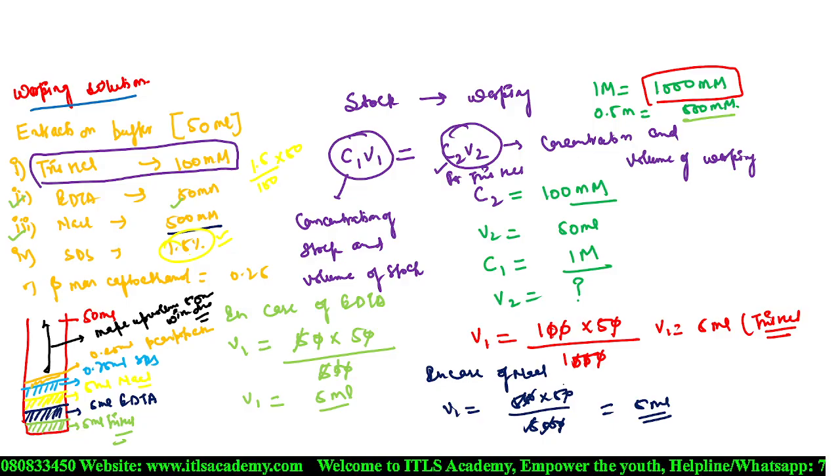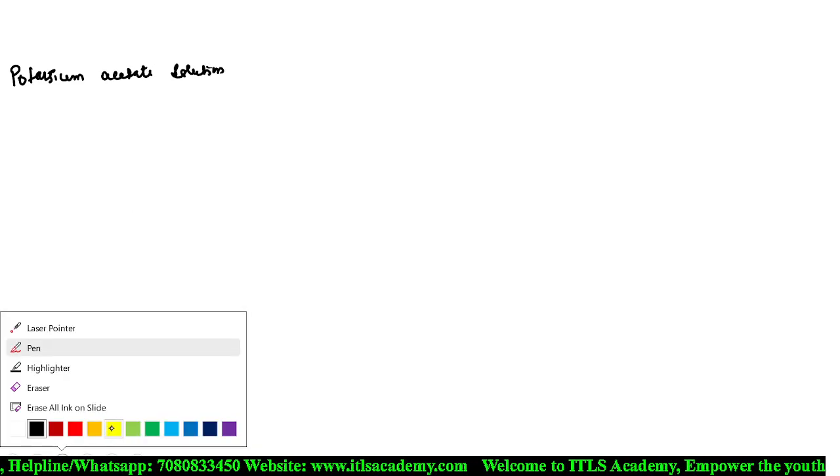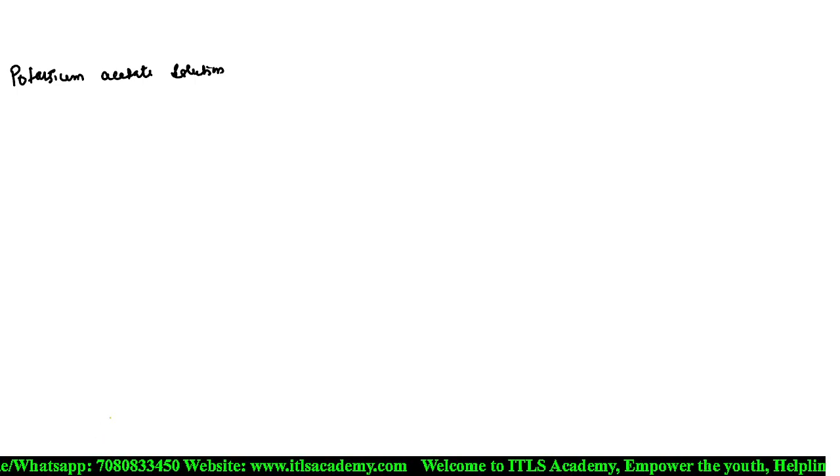Now, after that, you have to prepare the potassium acetate solution. Okay, so this potassium acetate solution will be prepared for 100 ml.